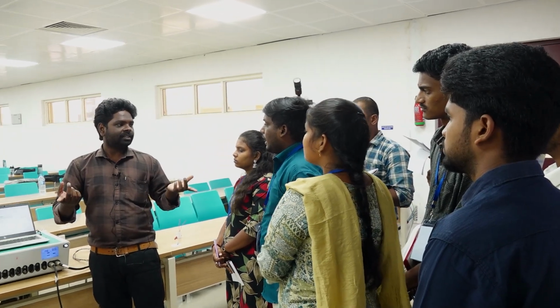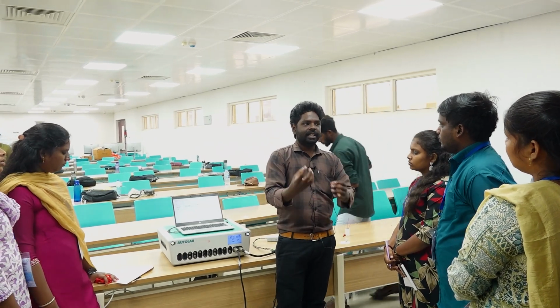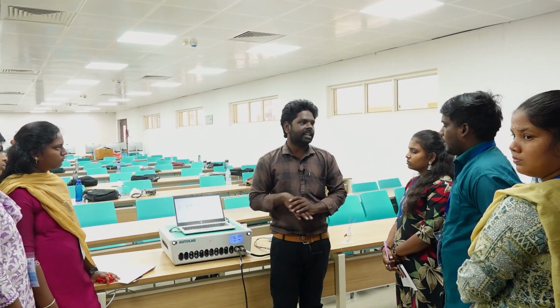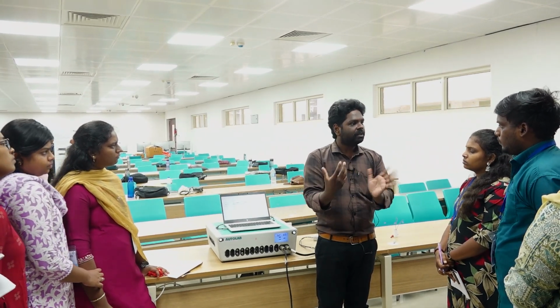In the form of charges, that is a capacitor. Then what does double layer capacitor mean? We are testing our cell, right? We have a sample, we dip it in the solution and run the EIS. Once we dip it in the solution, there will be ions in the solution, right?